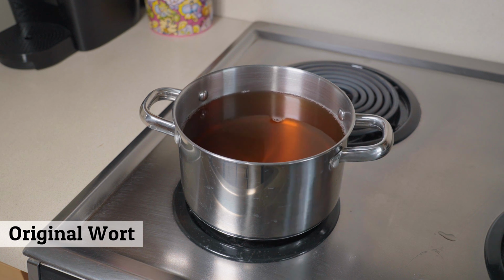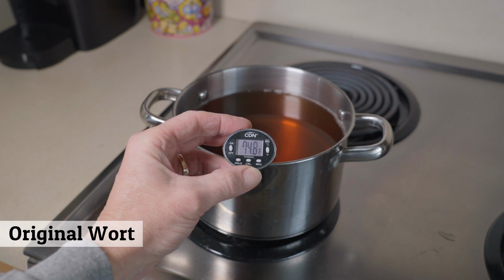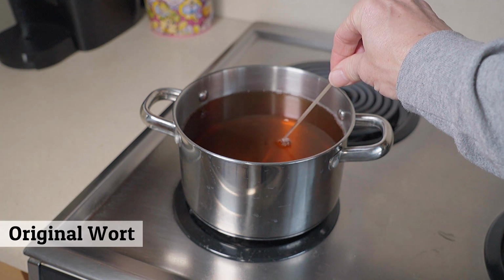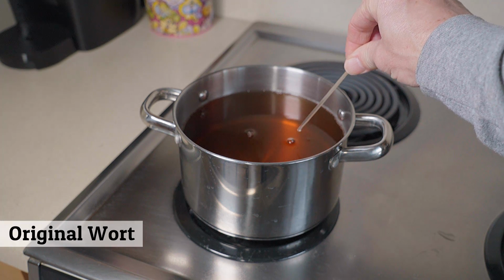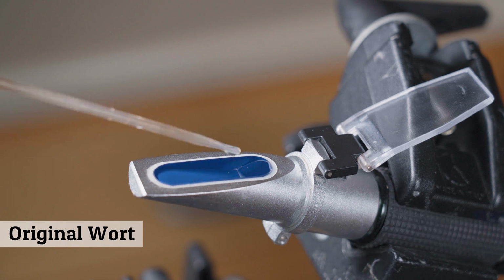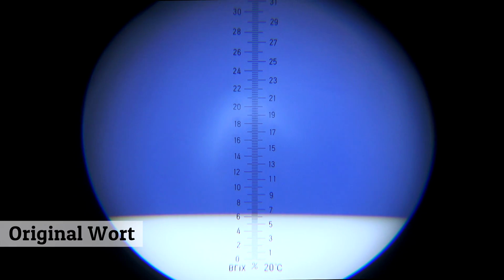So our first reading is just going to be room temp, and I just wanted to make it a normal temperature, so I moved it up to around 75 degrees Fahrenheit. I usually take a little bit up in the eyedropper and push it back out just to acclimate and make sure everything is just that wort that's in there. Okay, so now we're going to put it on the platform, and we'll see this reading. Looks like about 6.4, I'll call it. This will be our baseline to compare against as we do the other readings.